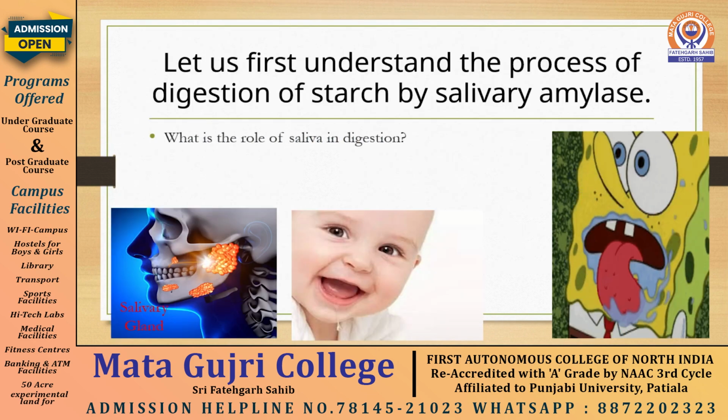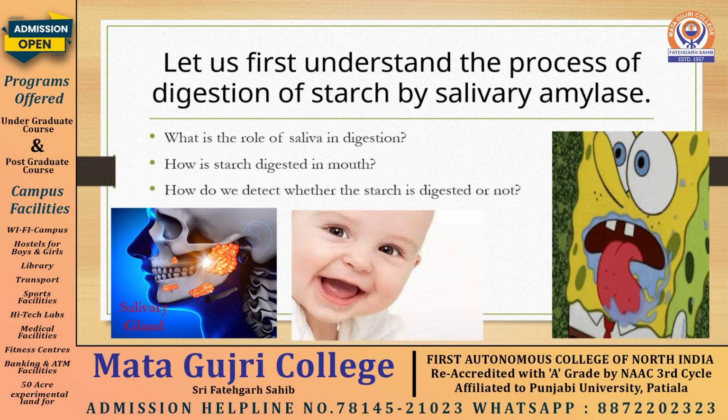Let us first understand the process of digestion of starch by salivary amylase. What is the role of saliva in digestion? How is starch digested in mouth? And how do we detect whether the starch is digested or not?